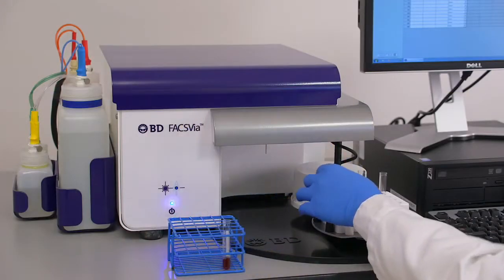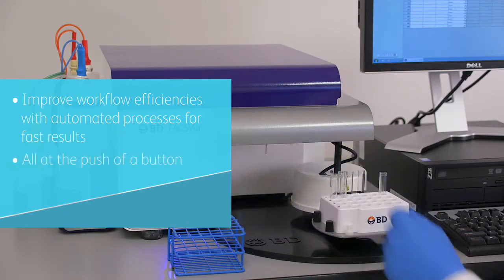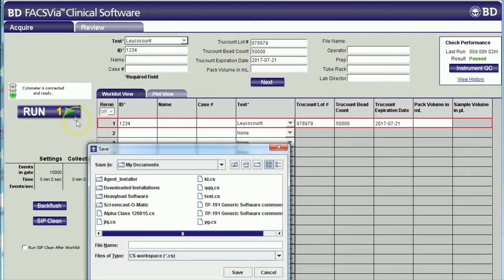The BDFAX VIA is designed for simplicity. An intuitive user interface simplifies workflow at the push of a button. Pre-loaded assay templates simplify sample analysis, and the BDFAX VIA loader automates sample loading. The BDFAX Link provides bi-directional LIS connectivity, minimizing transcription errors and saving time.